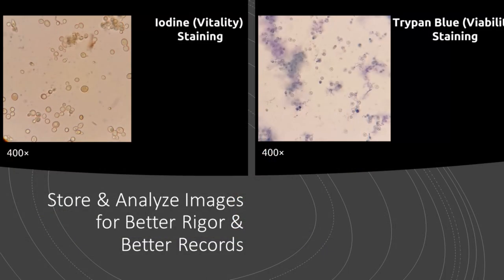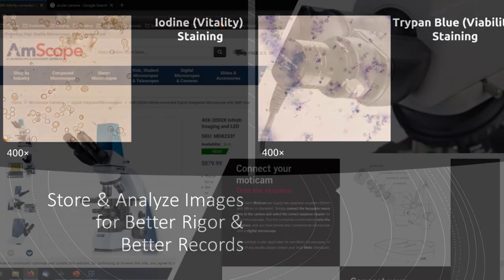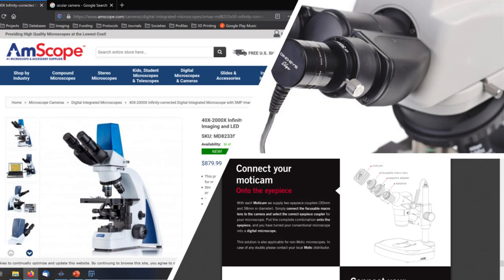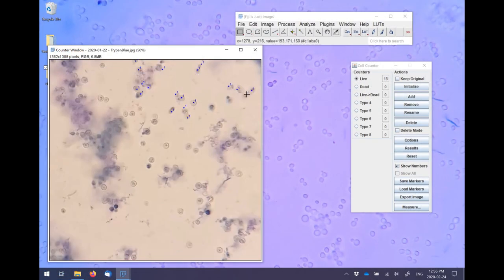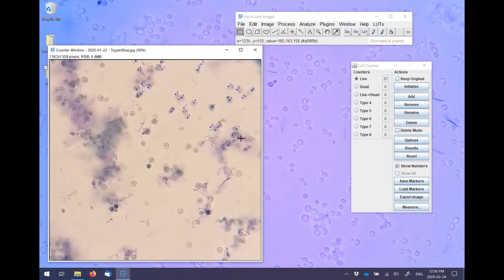In this episode I'm going to go over why you may want to use digital imaging to keep a permanent record of your brewery samples. I'll show you some options for capturing digital images through your microscope and I'll give you a brief demo of how a free software package can be used to perform more rigorous yeast counts using a hemocytometer.